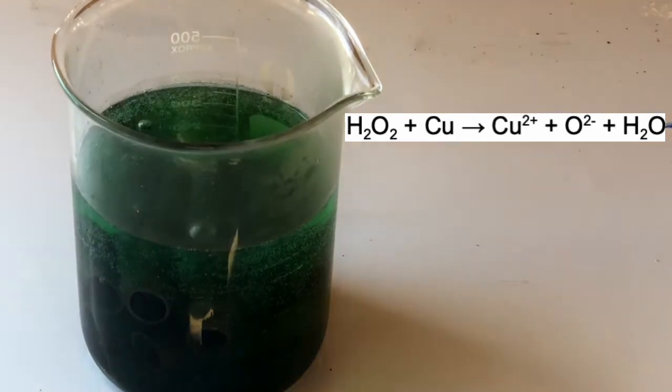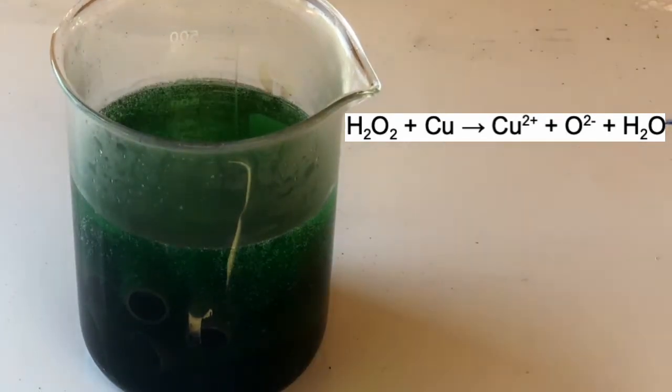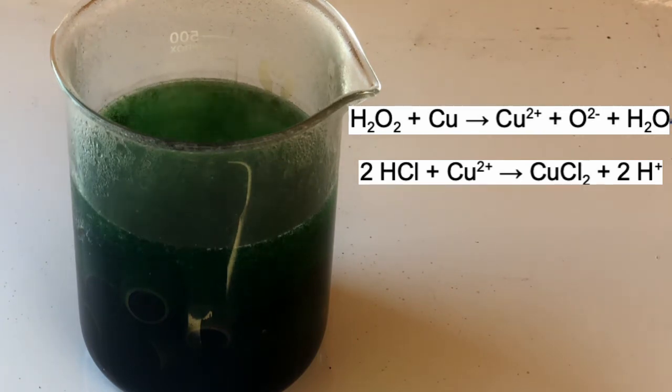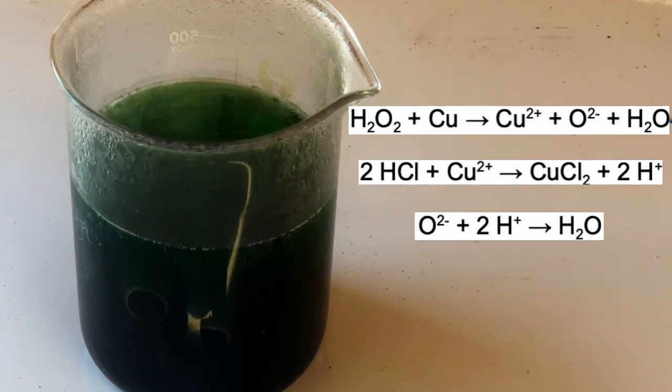What I think is happening here is the hydrogen peroxide is oxidising the copper into the cupric ion. As a side product, the oxide ion is produced as well as water. The hydrochloric acid then reacts with the copper ions to make copper chloride and two hydrogen ions. The two hydrogen ions then react with the oxide ion made in the first reaction to make water.